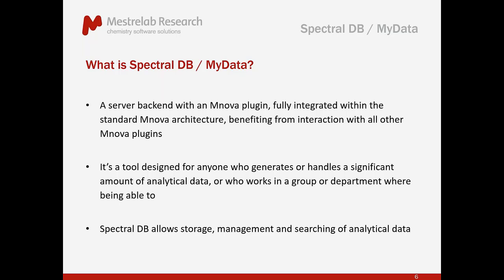It is fully integrated with the Mnova standard architecture, and this means that it interacts with all the other Mnova plugins. So, for example, when you want to search NMR, you do it from the data that has been opened with the NMR plugin. When you want to search mass spec, from data that has been opened from the mass spec plugin, and so on.